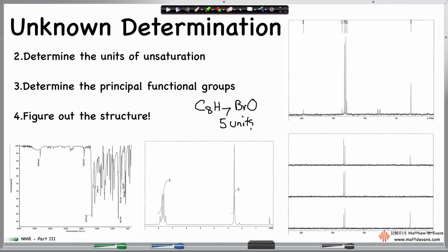I'm pretty confident that we have a benzene ring, and I'll show that right here. That already takes care of most of the carbons, 6 carbons. Now, what's the substitution on this benzene? Does it have one thing attached, or 2, or 3, or 4? The most helpful thing is the integration. It says 4 there, which means there are only 4 hydrogens left. We don't know yet how they're oriented, whether it's ortho, meta, or para. We'll try to figure that out as we go.